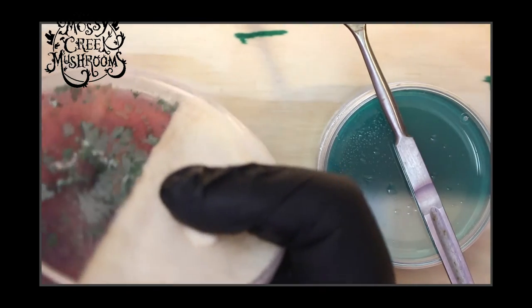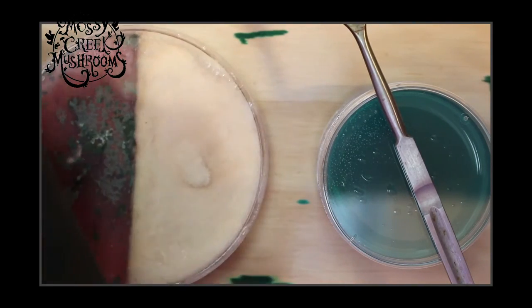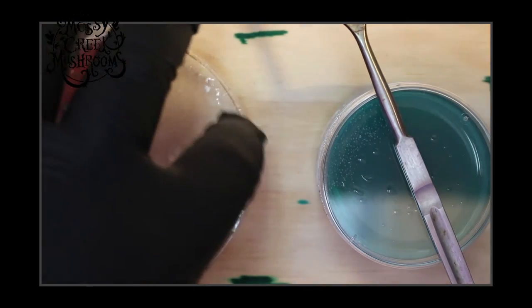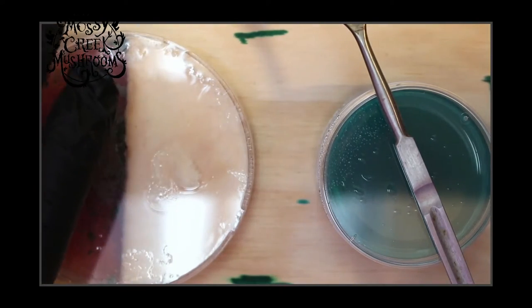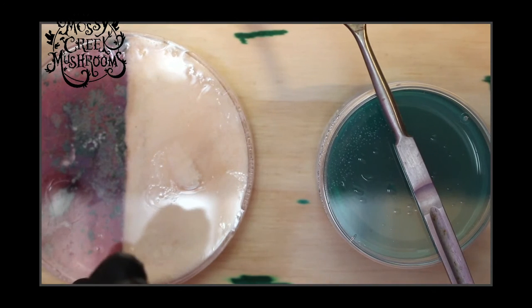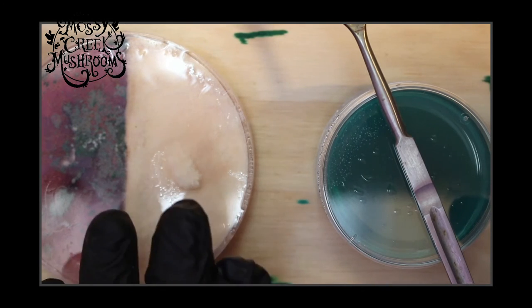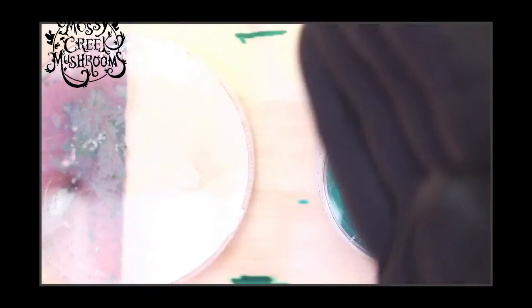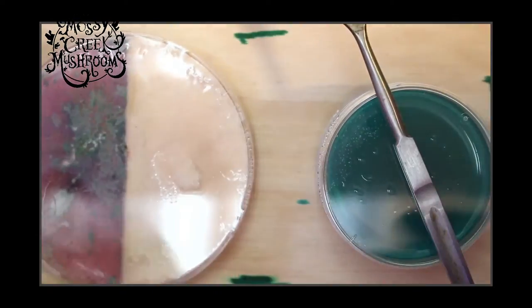We still have to open this and we want to try not to bump it around. When I open this, you'll see me open it from the chicken of the woods side so that the air currents have a little bit of space to travel and slow down before they hit the mold. Mold is still going to be riding in the air here. I'm going to lift it, make my cut, close the lid back — closing in this direction so any currents I'm stirring up move away from my clean plates.